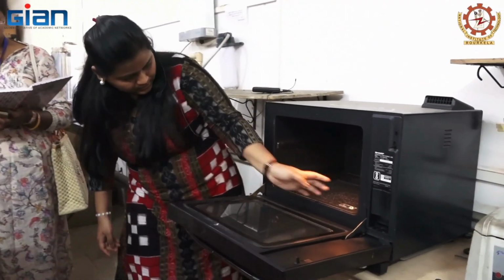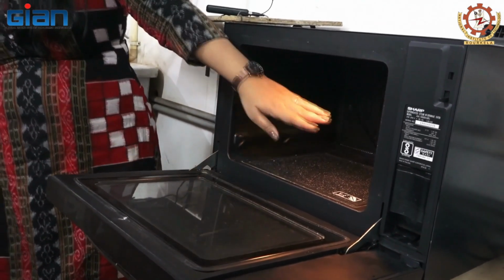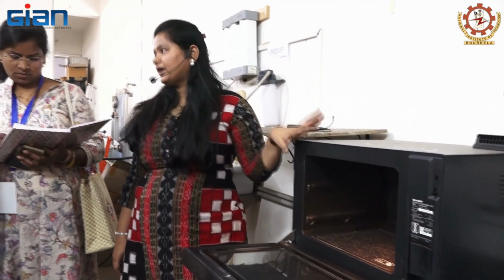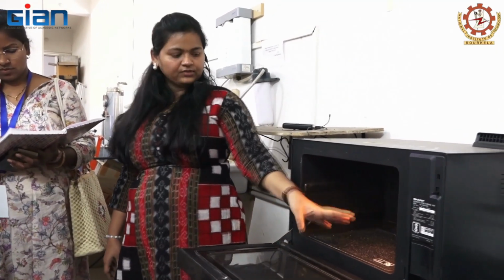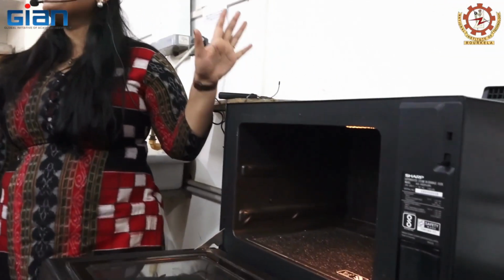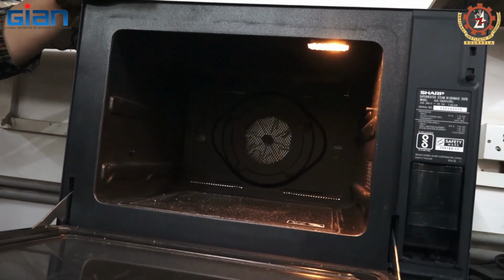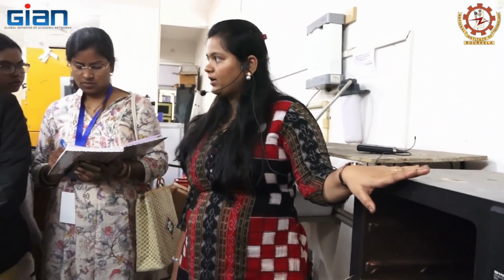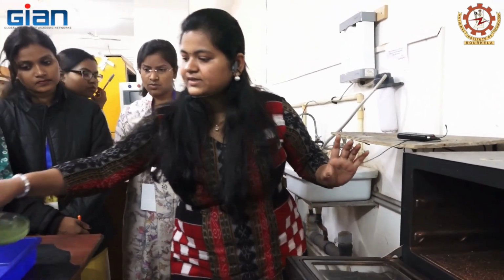Let's see here, on this side and these sides also, these are the magnetrons, and these magnetrons are responsible for generating microwaves. And this is the microwave cavity. The microwave cavity is where we place our samples. It should be made of a material that reflects all the microwave energy with no disturbance, because if it absorbed the generated microwaves, there would be no purpose in giving microwaves to the samples. And this is where we put our samples.